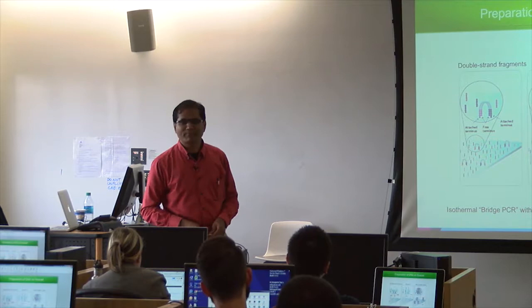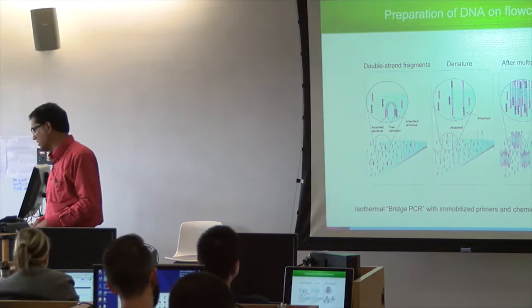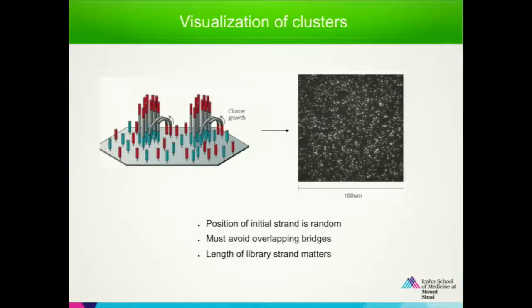So that is how you make these clones, and then you increase the signal, and that's how you sequence. It makes bridges between these two. That's what I call bridge amplification. Now I'm introducing some terminology which is popularly used with bridge amplification and clusters. When you sequence from one end to the other, bioinformatics people call it a read, because they're reading one sequence.